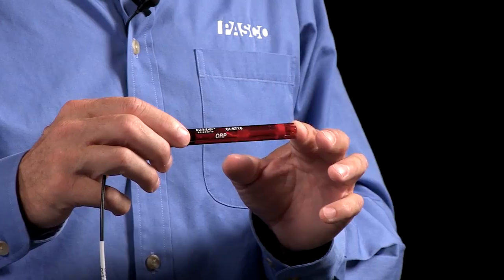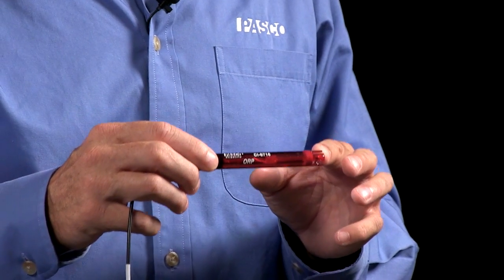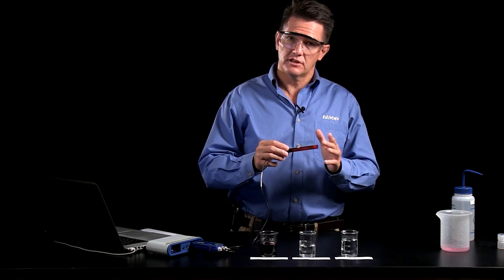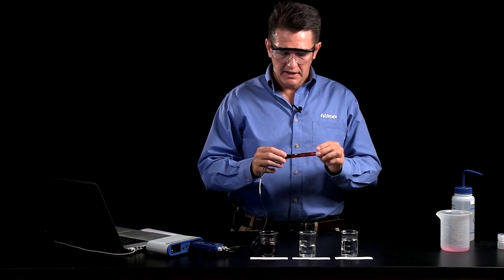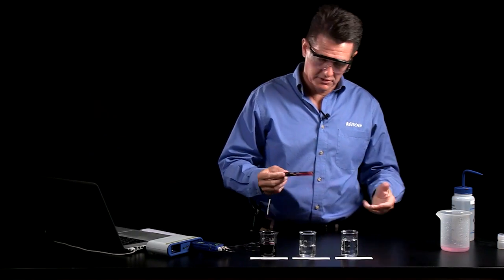Today I'd like to talk to you about the ORP, or the Oxidation Reduction Potential Probe. Sometimes it's also known as a redox probe. It measures the ability to oxidize or reduce in a solution.